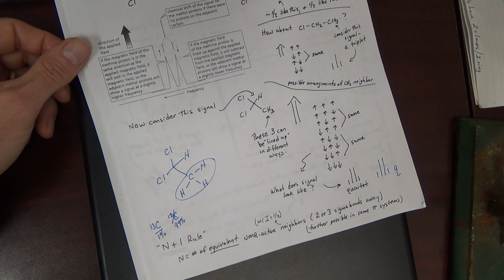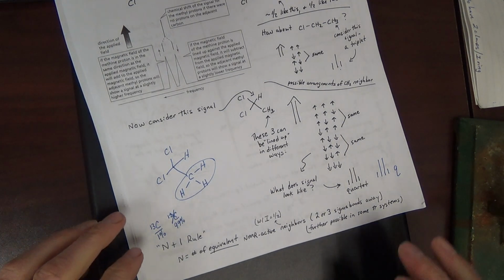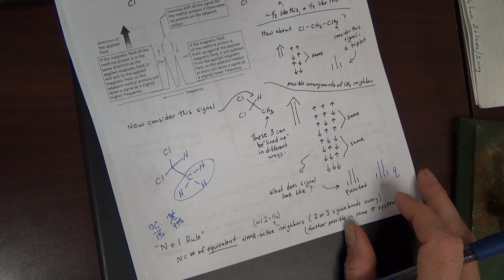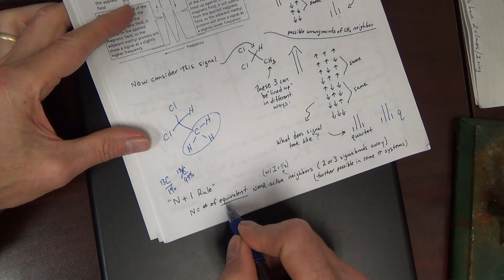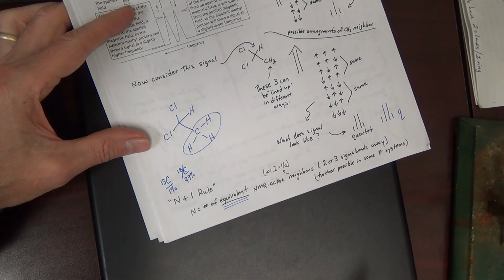Typically for us, only hydrogens are going to split the signal. If something else splits the signal, we will most likely point it out and discuss. Okay. Important here, though, the H's that are splitting must be equivalent. If they're not, we're going to have to consider some other things.